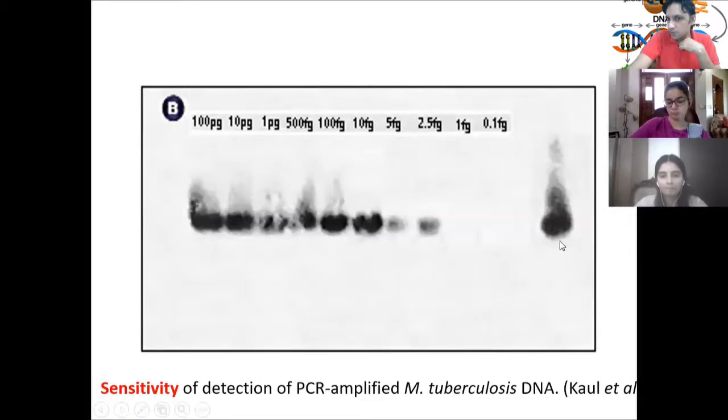you see the positive control is here. So that means your system is working. You see the negative control is giving no products. That means your system is working. And you see the patient sample is not giving anything. So you are sure that that person is not carrying any infectious. That person is not carrying that DNA. If you are analyzing SARS-CoV-2, you can tell that the person is negative.